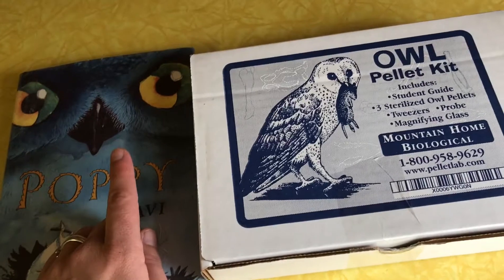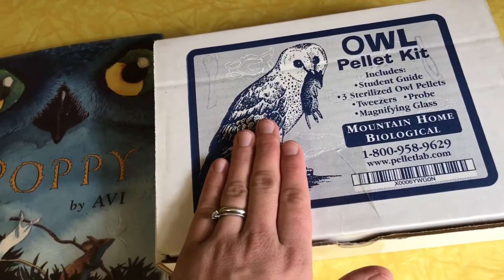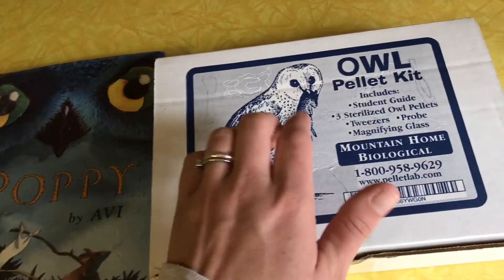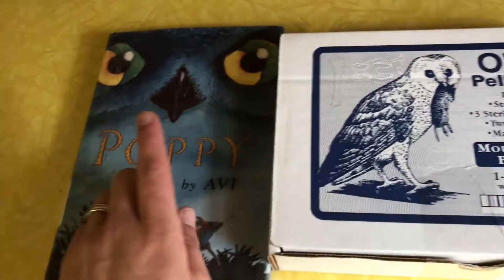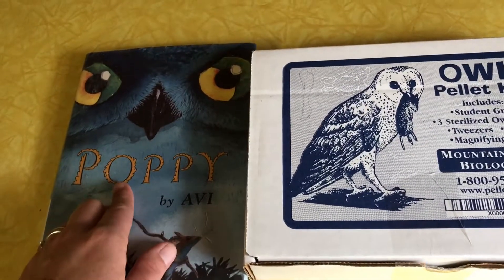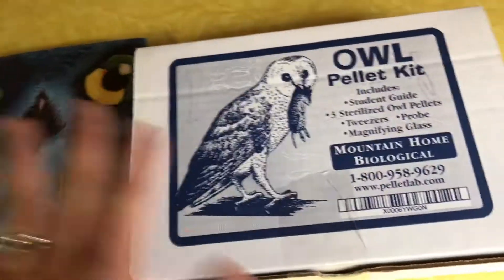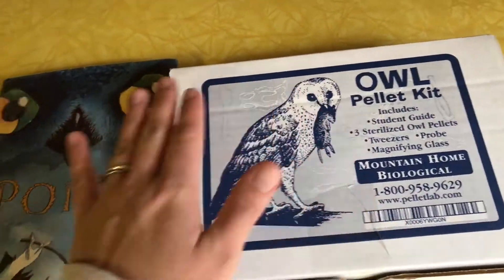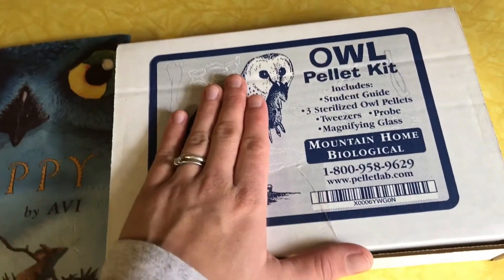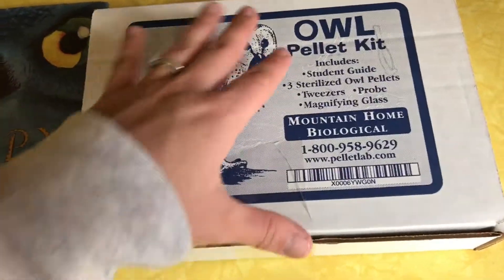I probably would have ordered this anyway, but in the curriculum that we use, it was suggested that we dissect an owl pellet, since this literature read aloud is about an owl — an owl is one of the main characters. So, to tie in science with our literature, we're going to dissect an owl pellet, which I have never done before. And I was really excited to get this in the mail today.